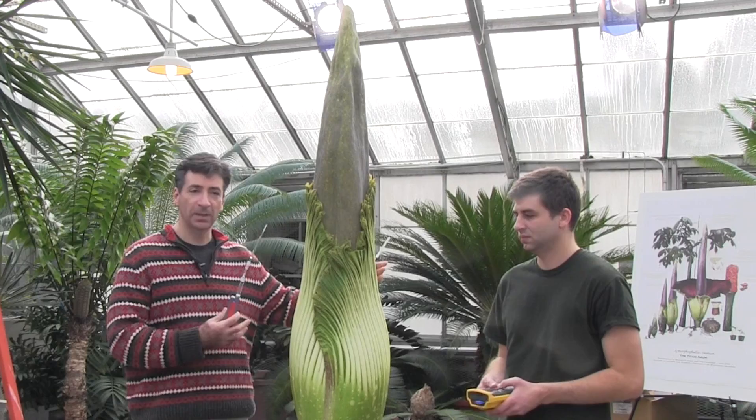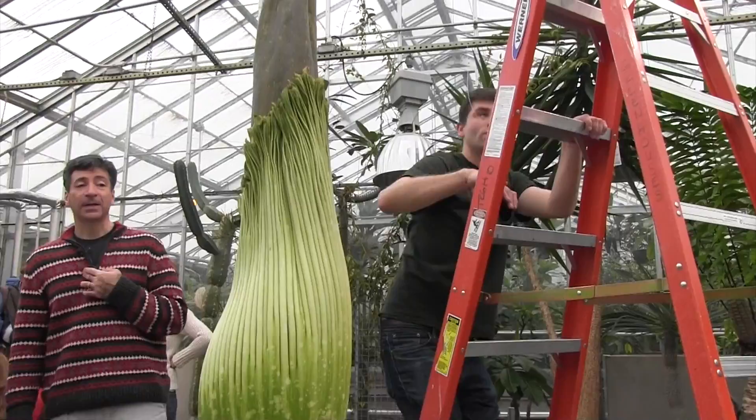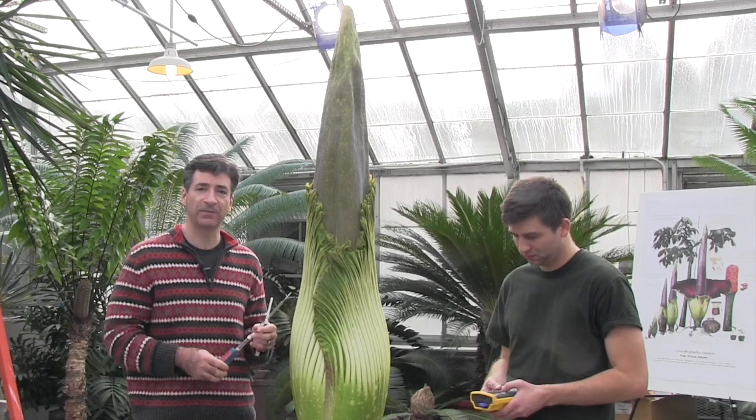When Wee Stinky starts — when the spathe begins to open and the show goes on — we're going to have a fishing line dangling from the girders above the plant to support this little battery-operated vacuum pump. That will allow us to collect volatiles from the flower.